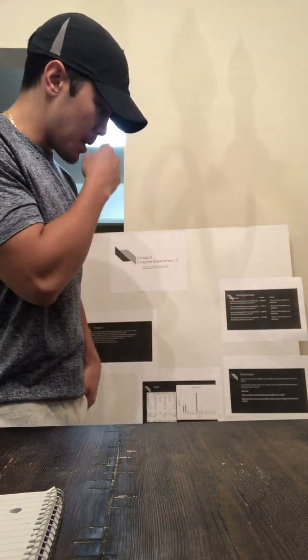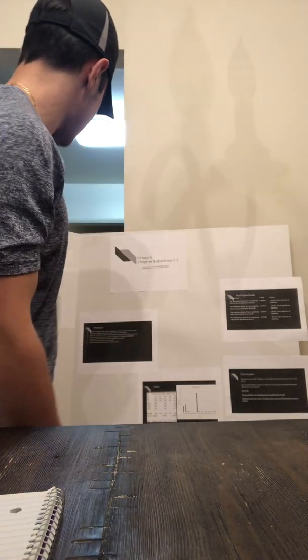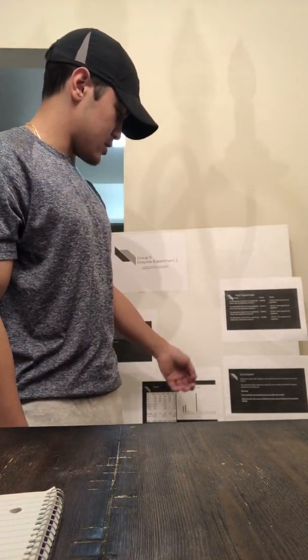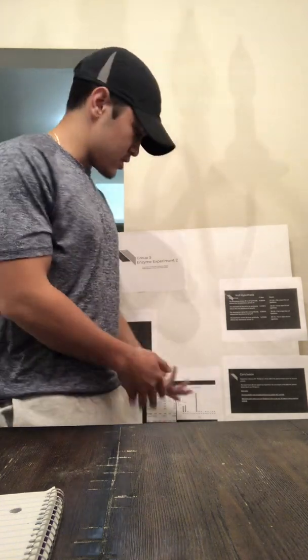Now, in conclusion, we set our hypothesis that our optimal temperature would have been 50. Our experiment did not support our hypothesis because, based on the data, optimal temperature is 30.